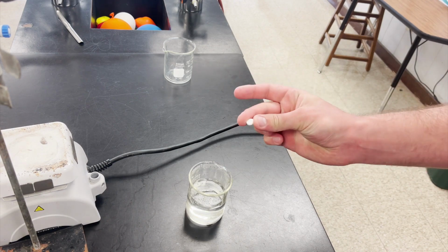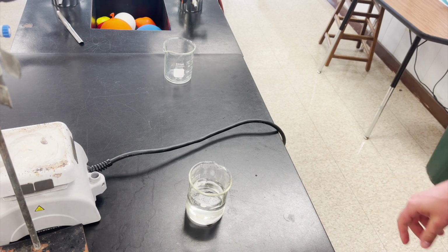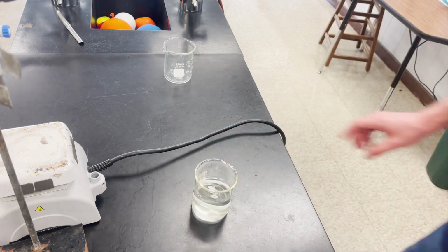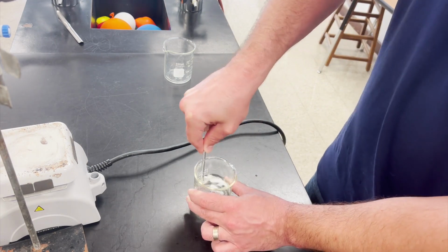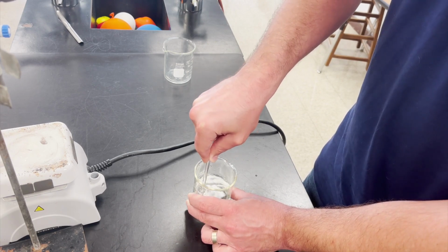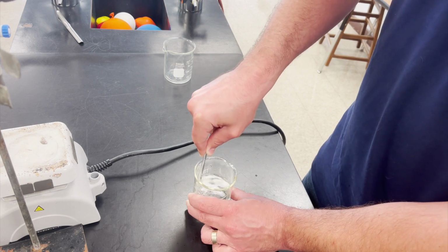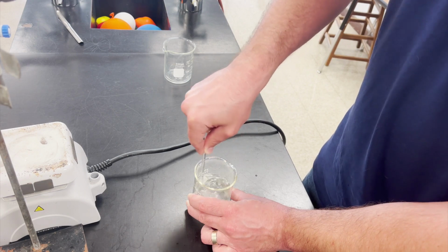So I'm going to take an aspirin tablet, put it inside of there, and give it a little bit of time to dissolve. What I'm doing right here is crushing it up with the stir rod, increasing the surface area, if you will. And it will over time dissolve.